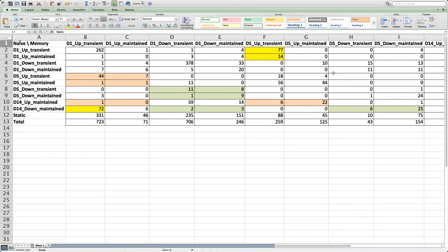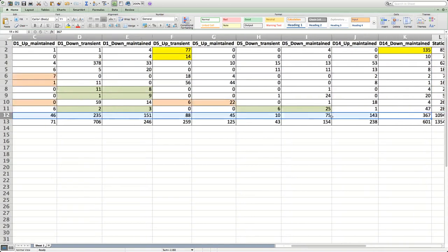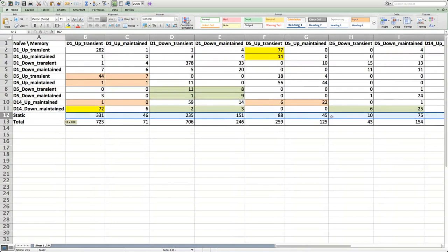Sorry, can you go back to that? Sure. So the ones like here, for example, would all be genes that did something in naive but didn't do anything in memory. Right. And then similarly, the ones here would be things where something happened in memory but nothing happened in naive cells. And as I was thinking, that's a really interesting group too, right? Yeah.